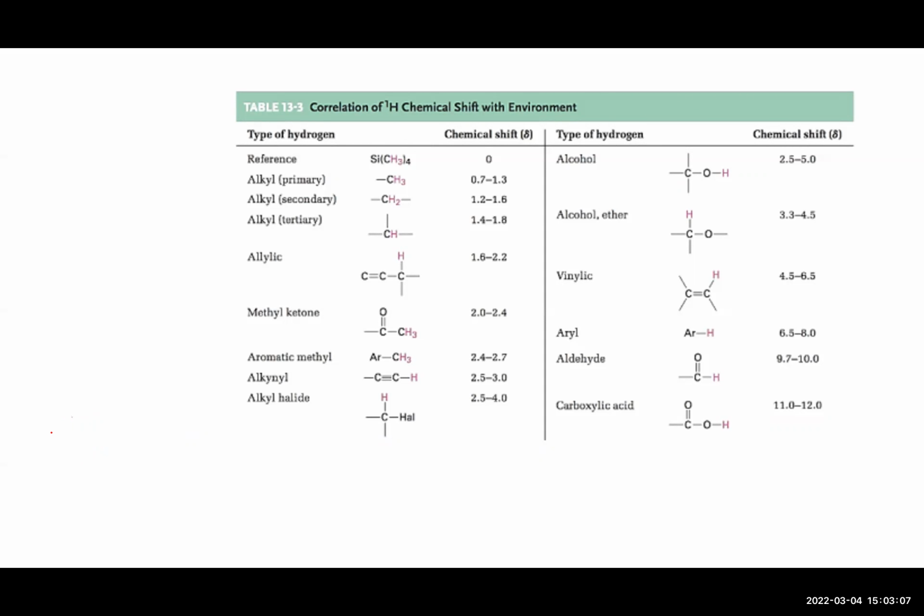I'll make a little more room, my table is way too big. And then I think my labels were A, C, and B.